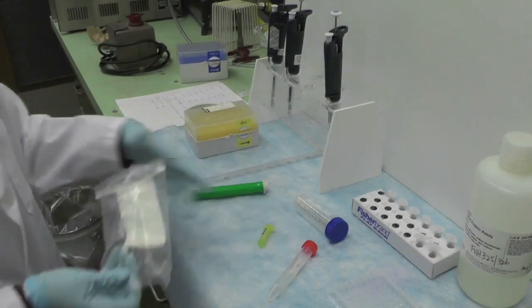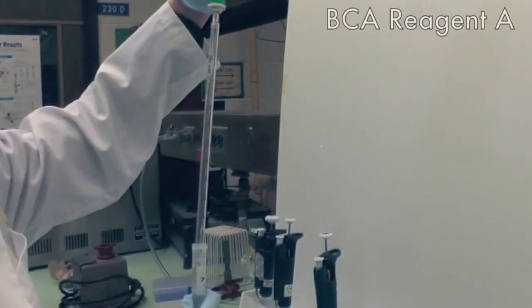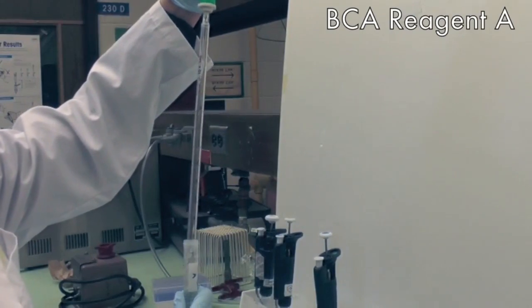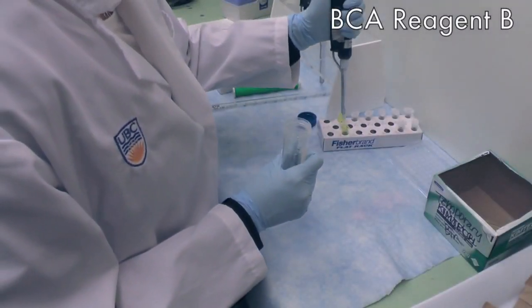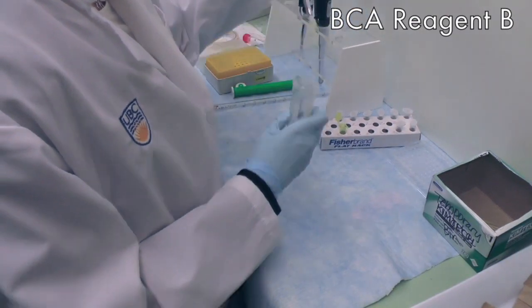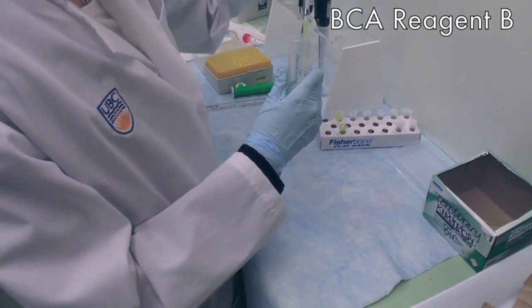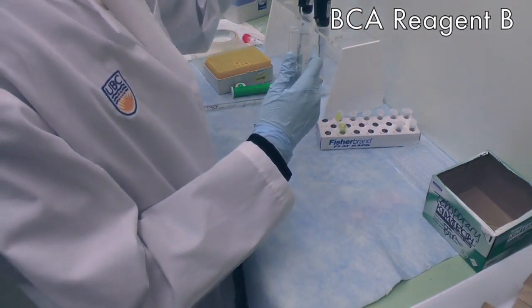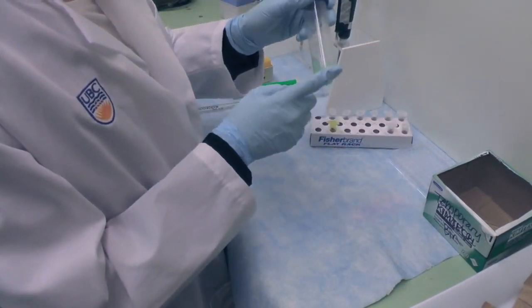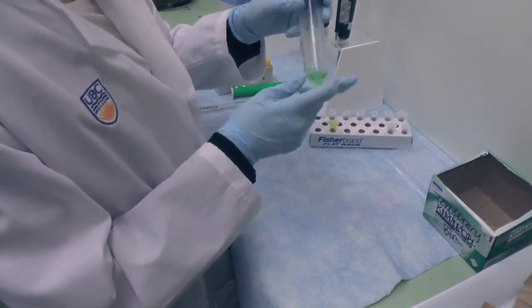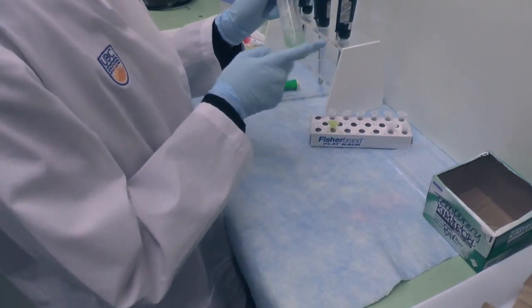Next, pipette the proper amount of BCA reagent A into the falcon tube. Then add the proper amount of BCA reagent B and mix to produce the BCA working reagent. Be aware that each well needs 200 microliters of the BCA working reagent, so make sure you prepare enough working reagent for the assay.